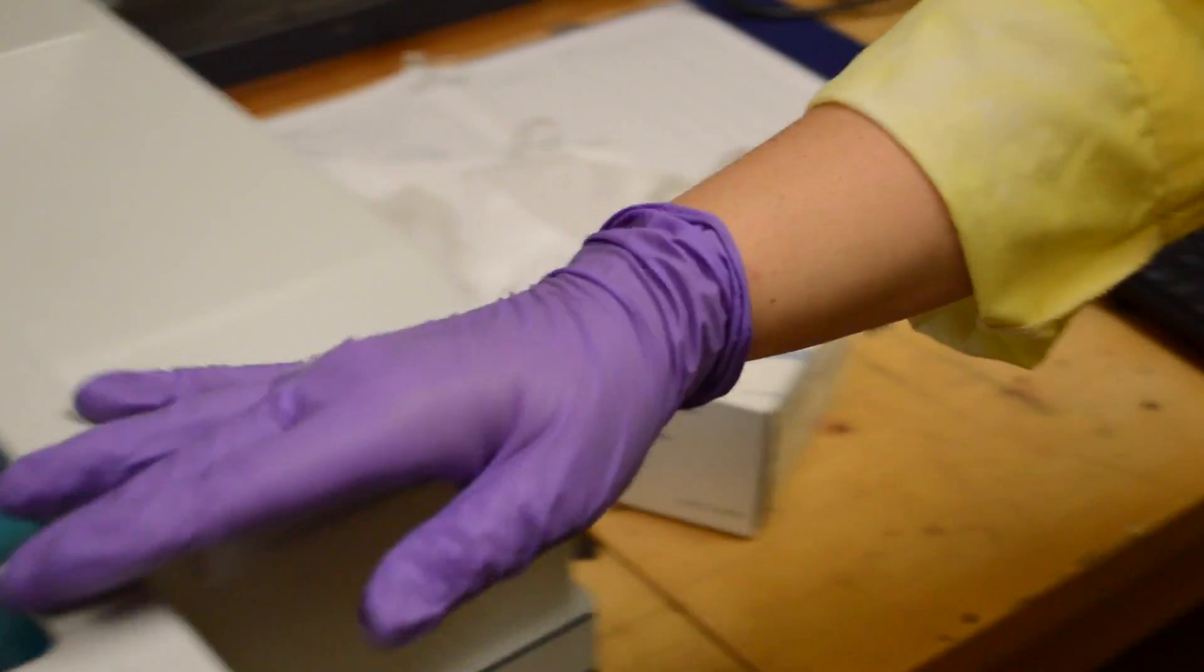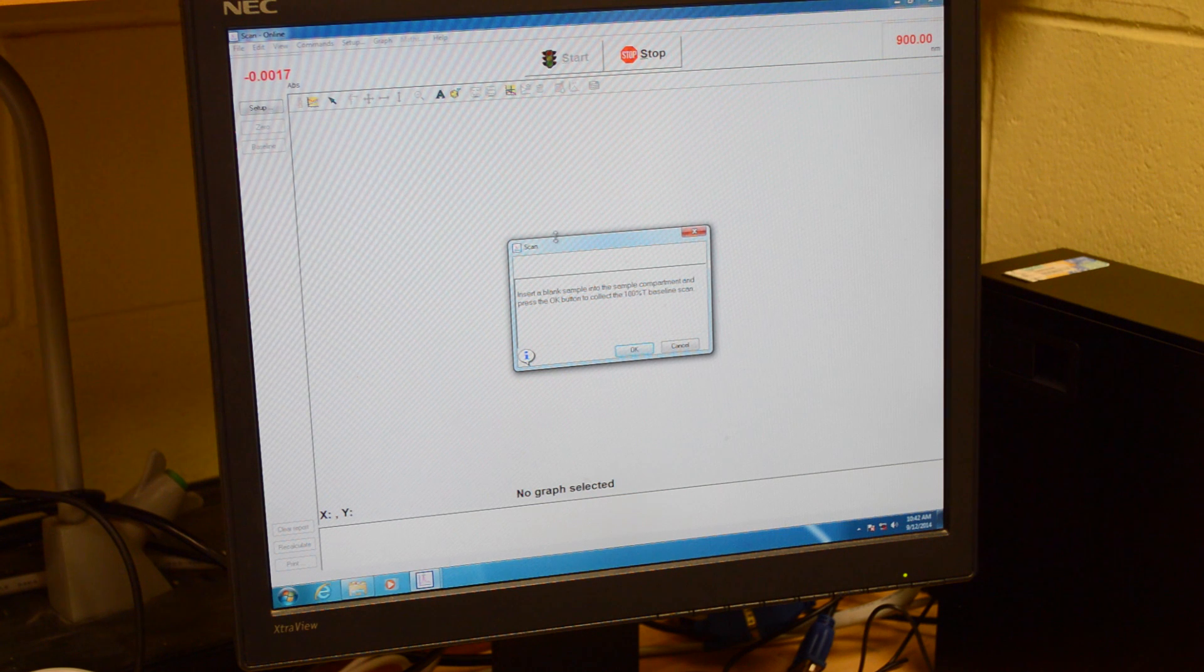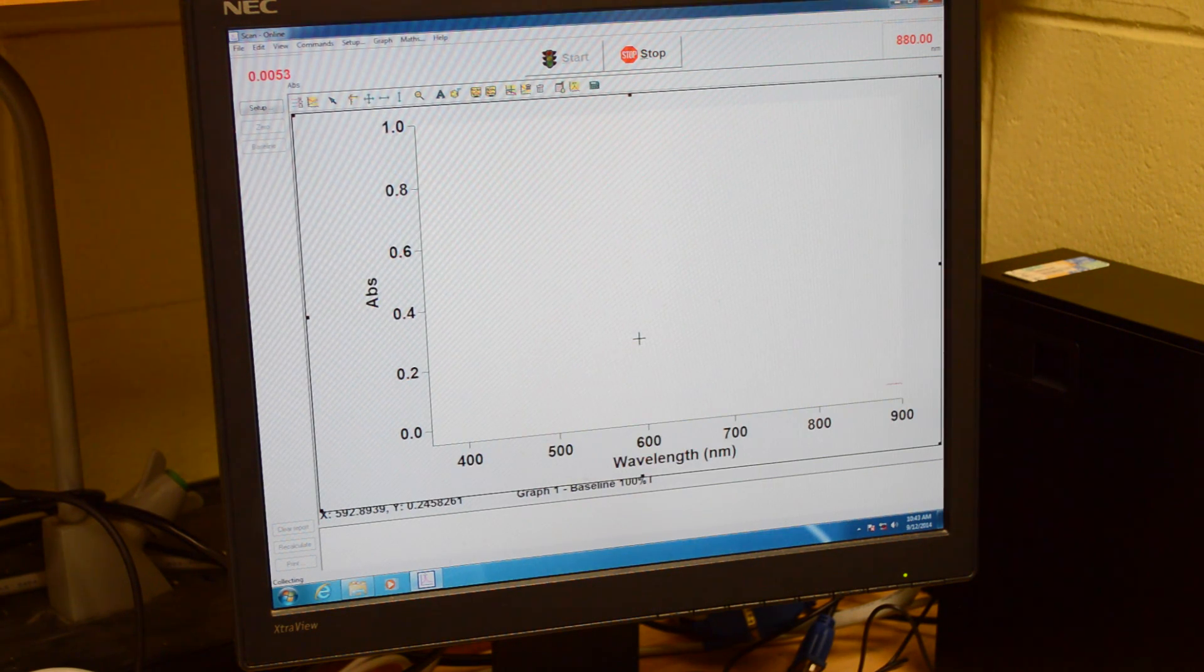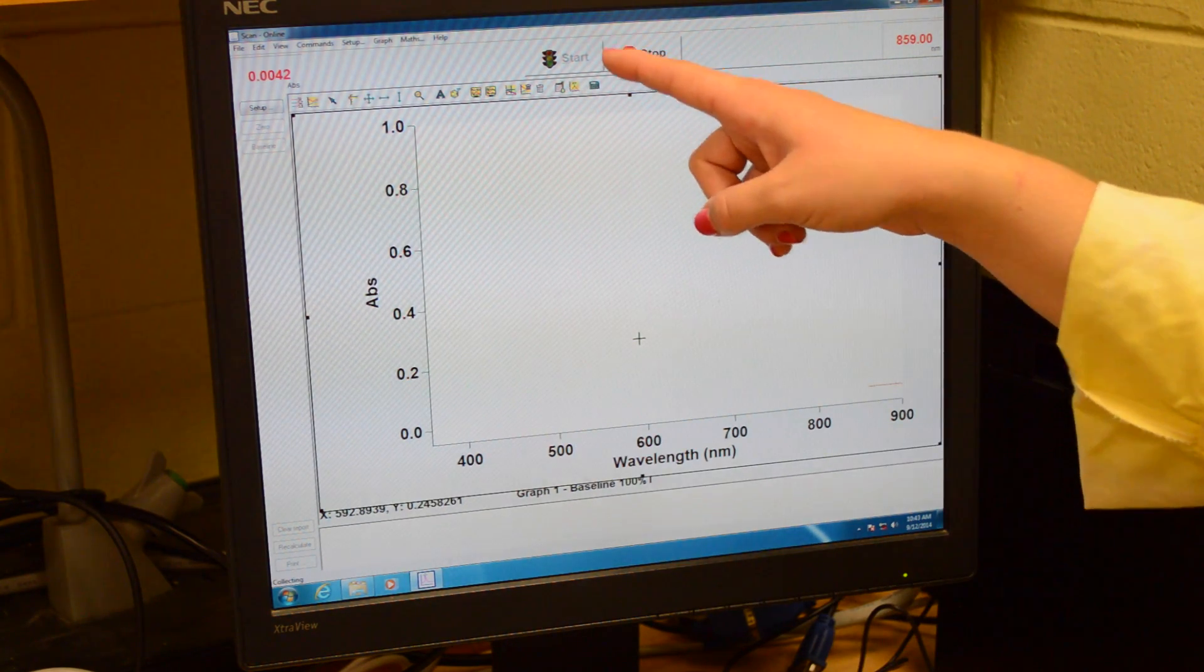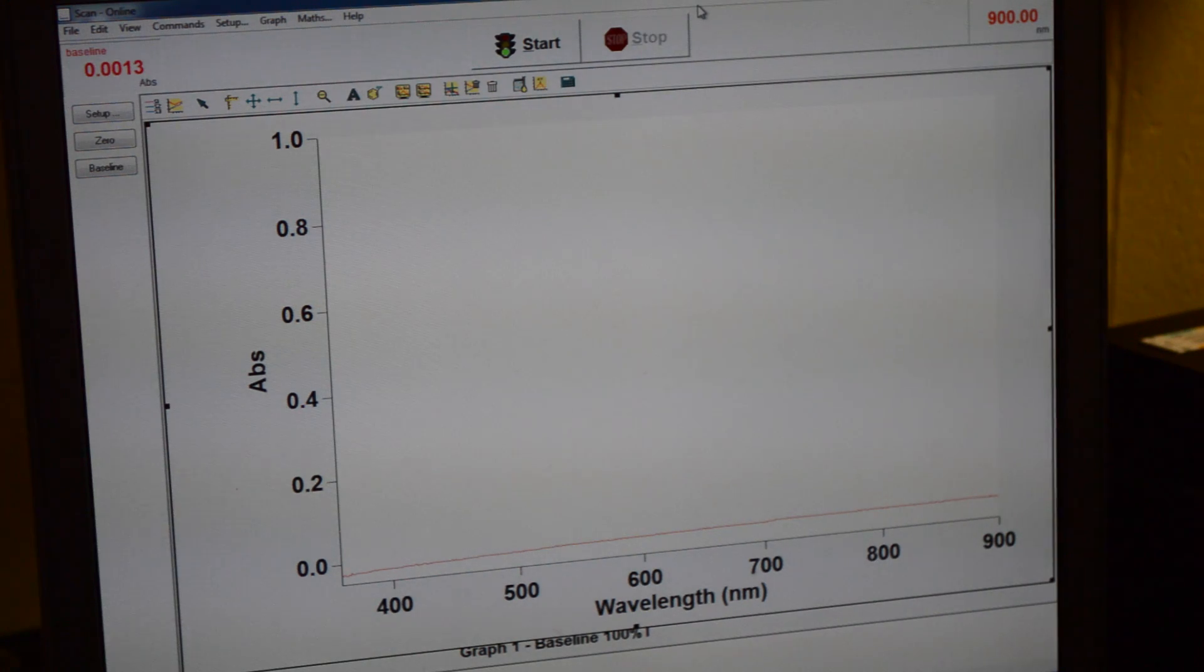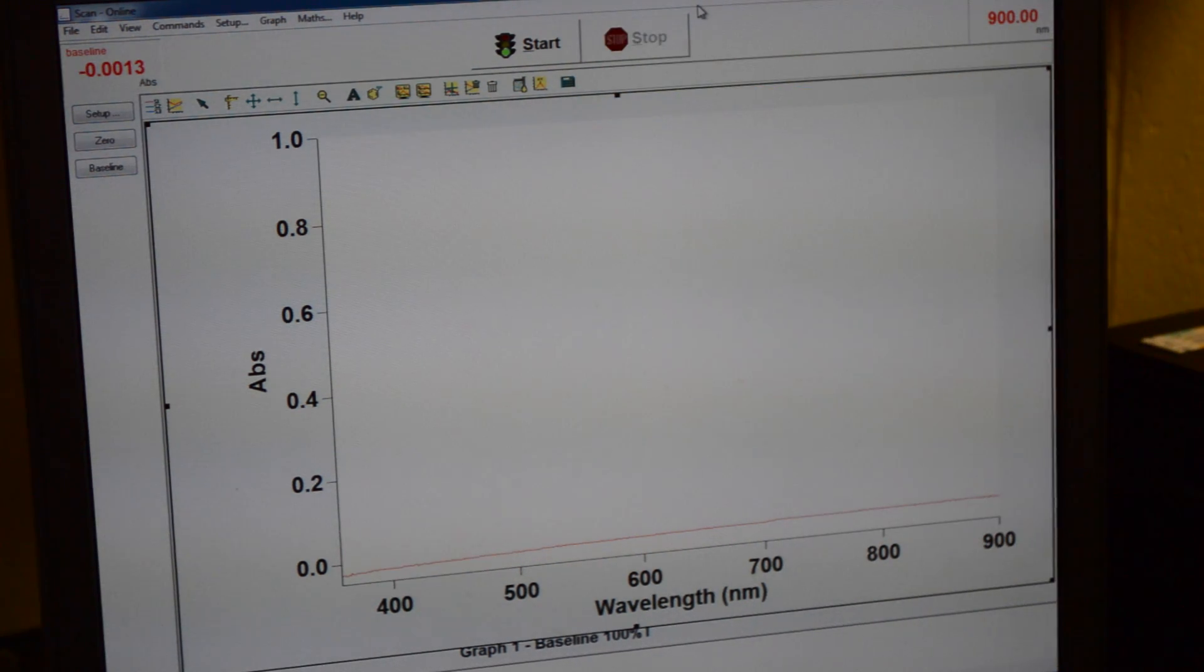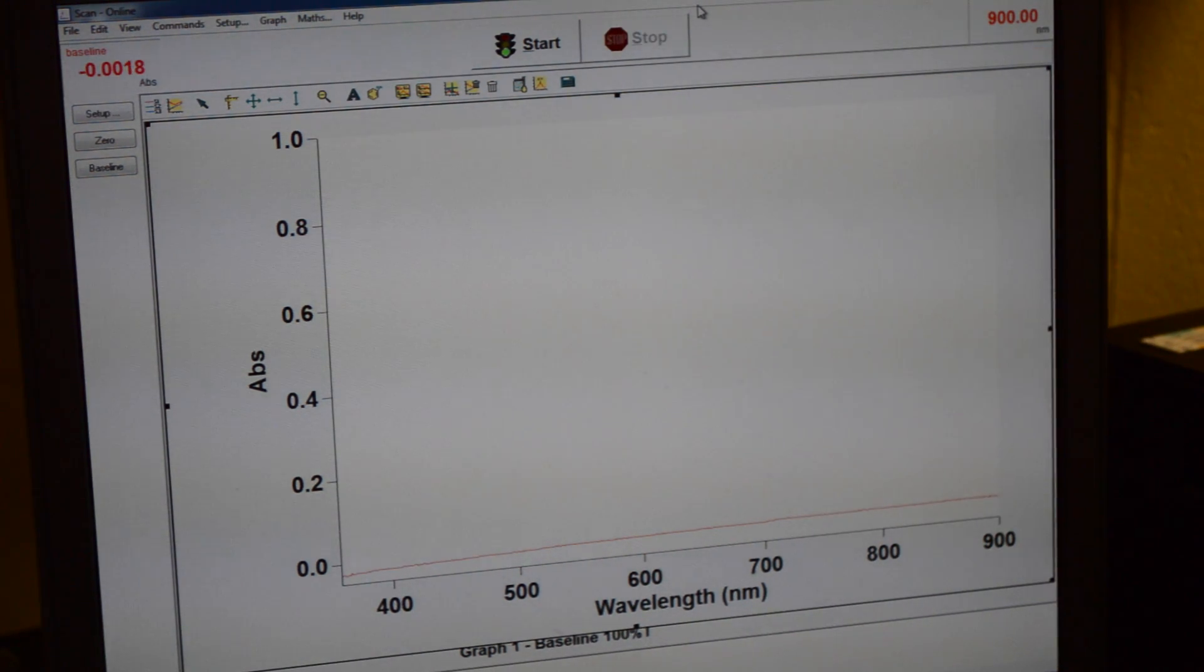Then we go back to the computer. Here there is a screen that will say insert a blank sample into the sample compartment and click OK to collect the 100% baseline scan. So here we just wait until the start button turns green again. As you can see, the green start button has lit up again. To ensure that the system is zeroed, we are going to run a sample on the blanks. To do this, you just press start.